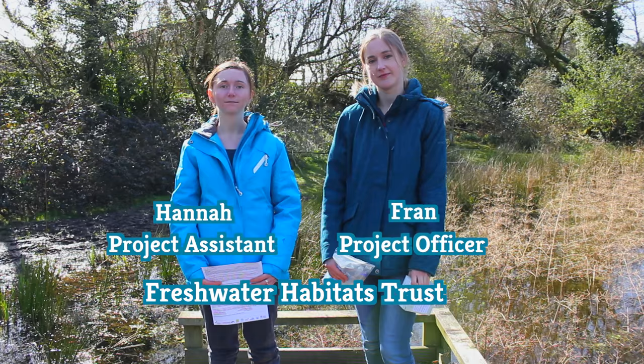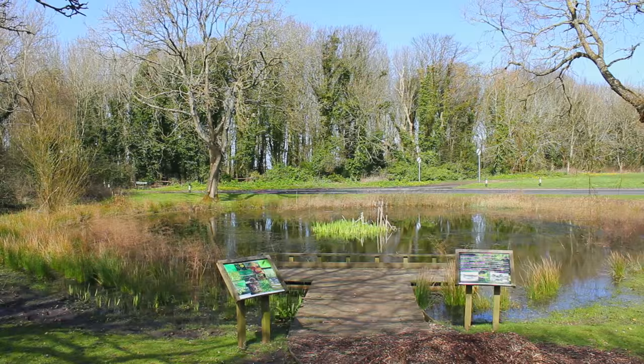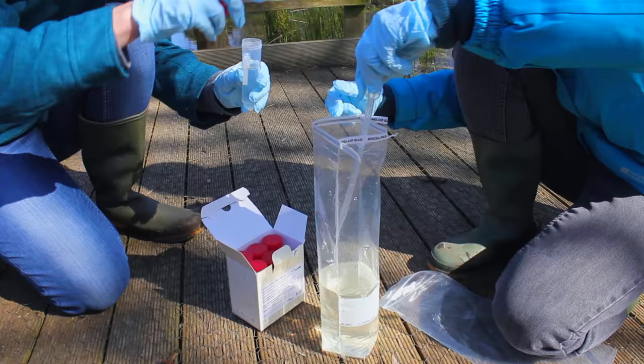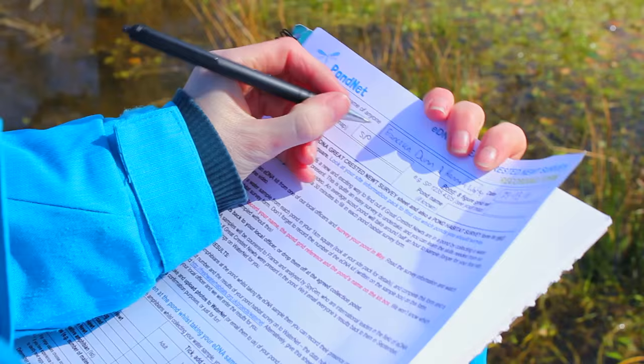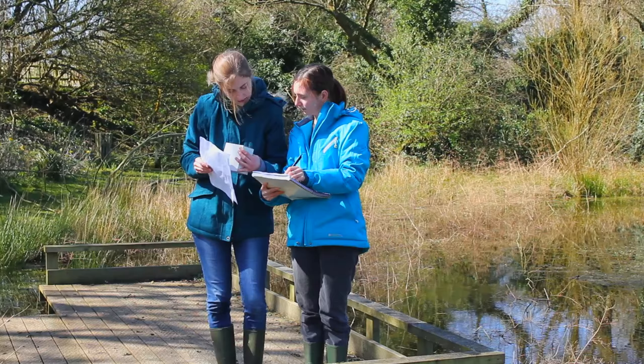Hi, I'm Fran and I'm Hannah. We're from Freshwater Habitats Trust. Today we're going to show you how to use an eDNA kit to survey for Great Crested Newts as part of the People, Ponds and Water Pondnet project. At each pond we're asking you to collect a water sample using an eDNA kit and also asking you to complete a pond habitat survey form.